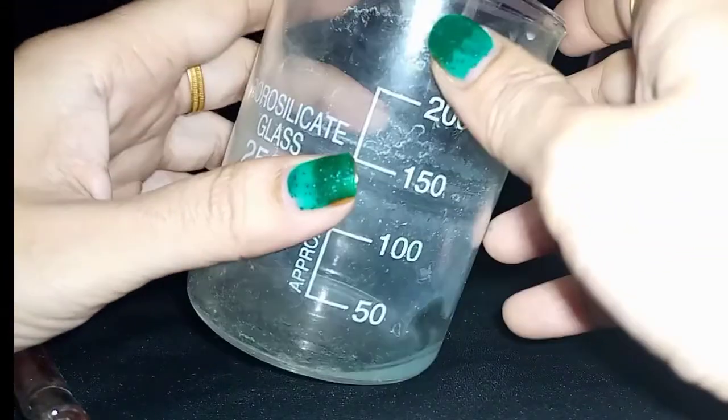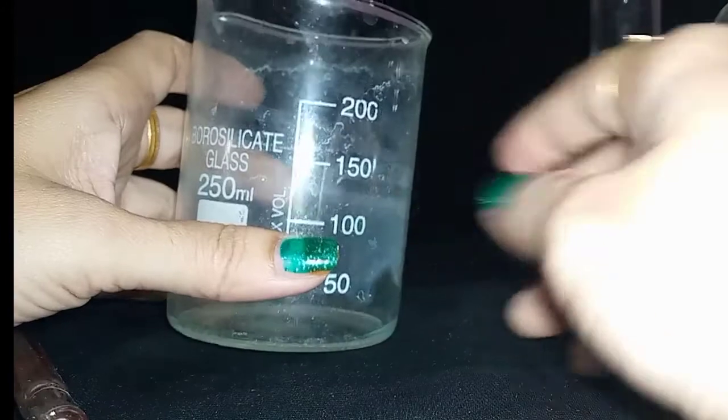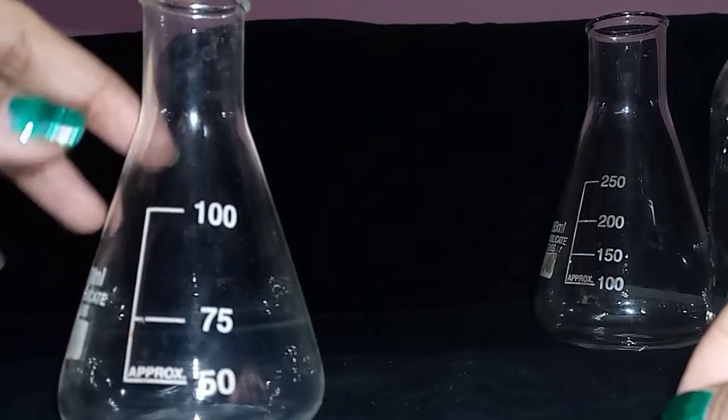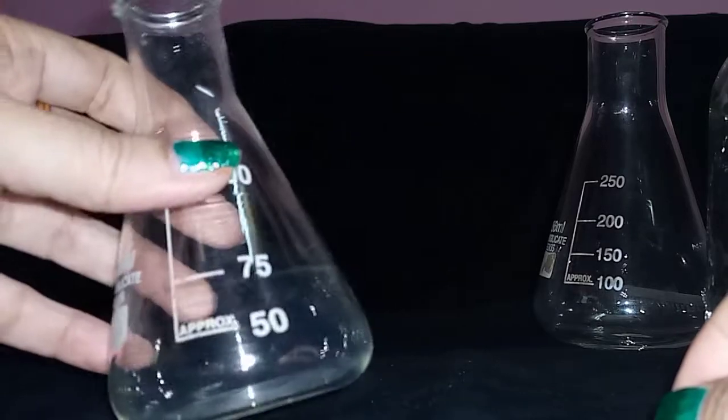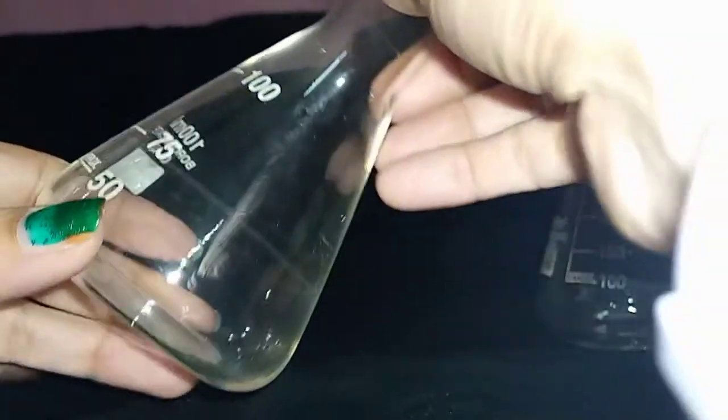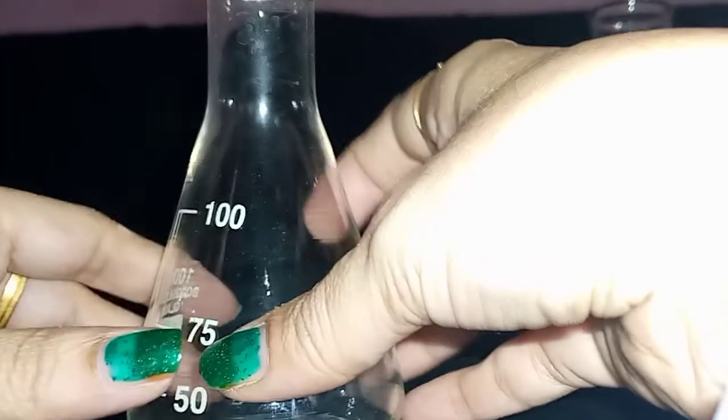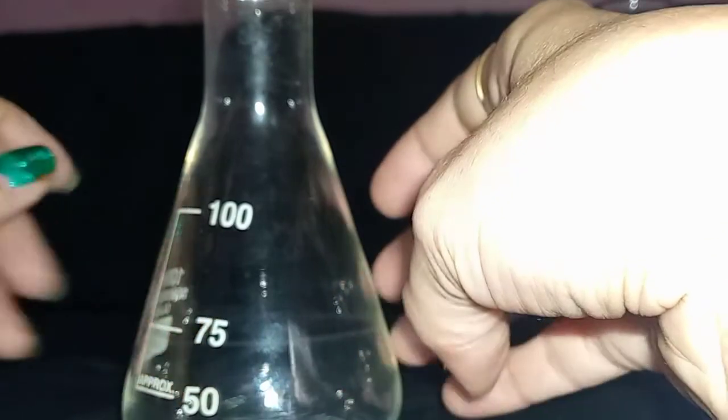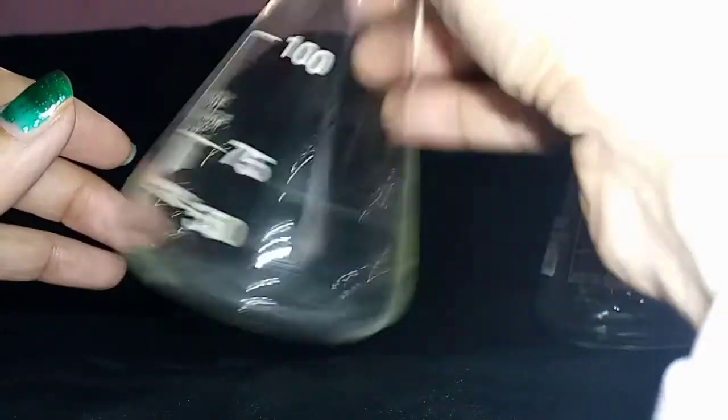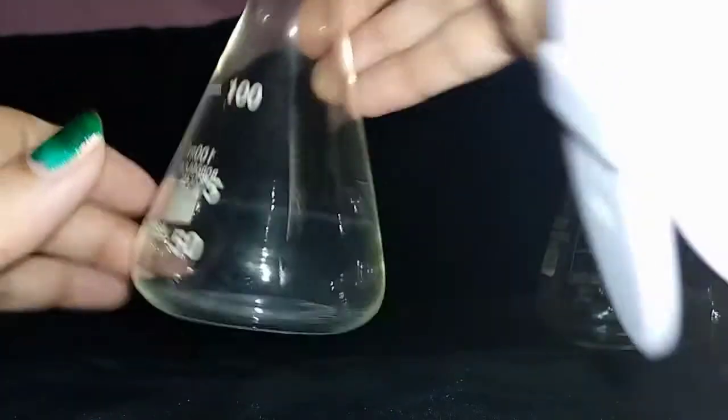Now here, this one is called a conical flask, also called an Erlenmeyer flask. Conical flasks are used in titrations for carrying out reactions. Due to their conical shape, these flasks are efficient in containing splashing of chemicals while we are swirling.